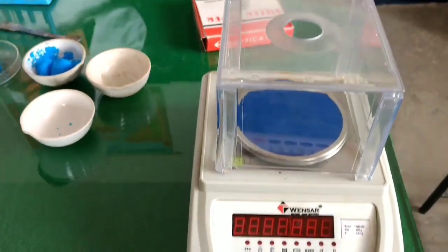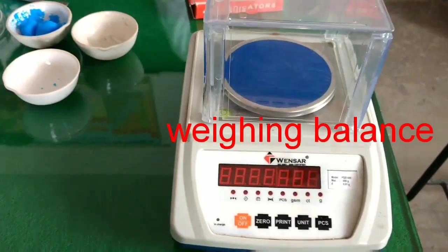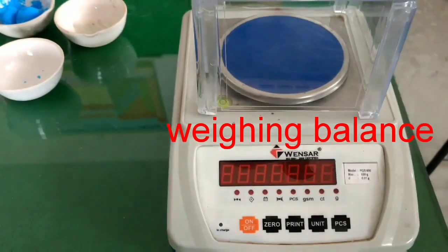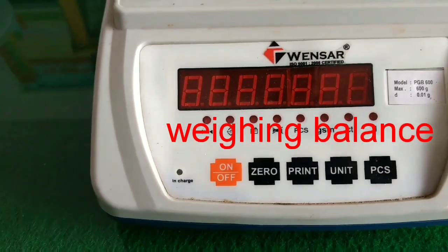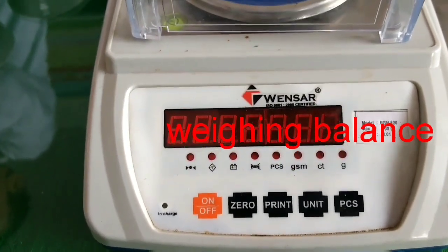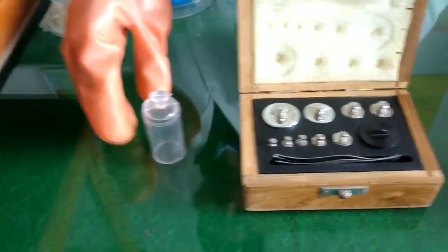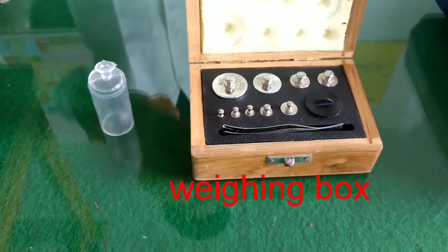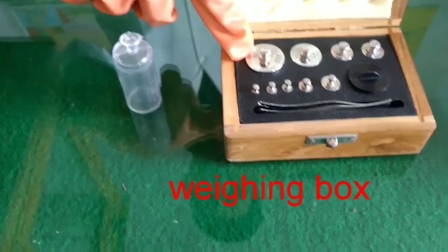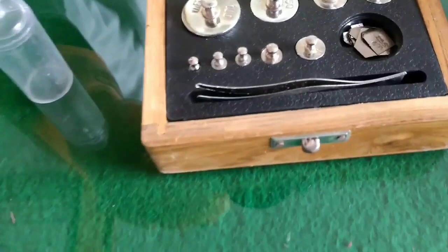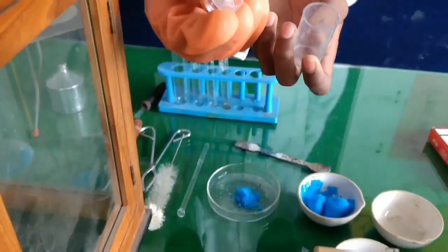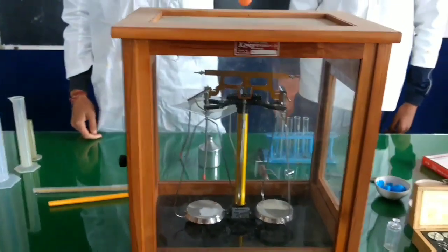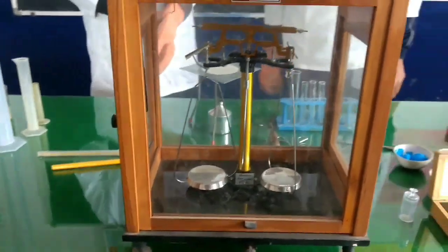Now, coming to the weighing part. This is a weighing balance. Of course, in CBSE, the CBSE don't allow the digital weighing balance. It always permits the use of analytical balance. This is analytical balance and these are the weights. This is a weighing box and weighing tube. In weighing box, we are having different types of weight boxes starting from 1 gram to 1000 gram. This is weighing tube. And this is analytical balance. But nowadays, all labs are using the digital balance.